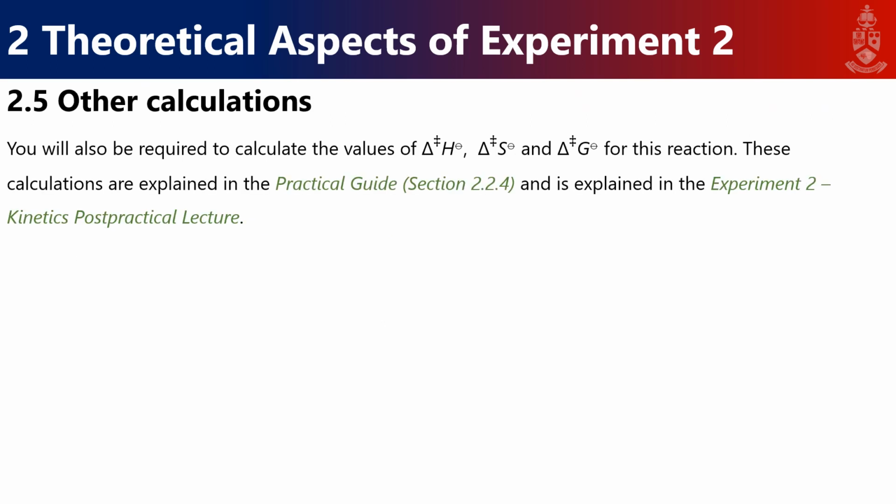You will also be required to calculate the values of the enthalpy, entropy, and Gibbs energy for this reaction. And these calculations are all explained in the practical guide in section 2.2.4 and also in the post-practical lecture. So please refer to that for methods on how to calculate these quantities.